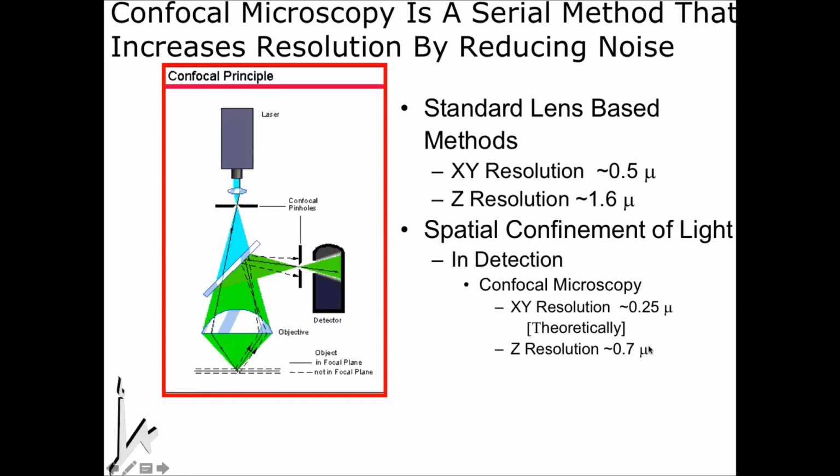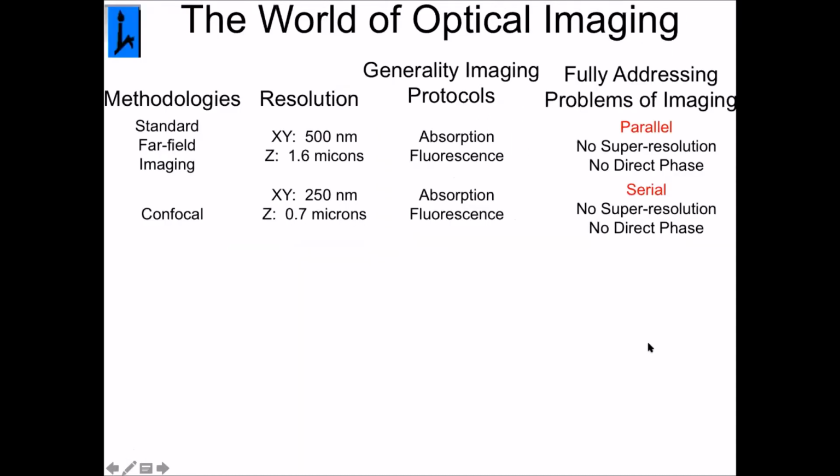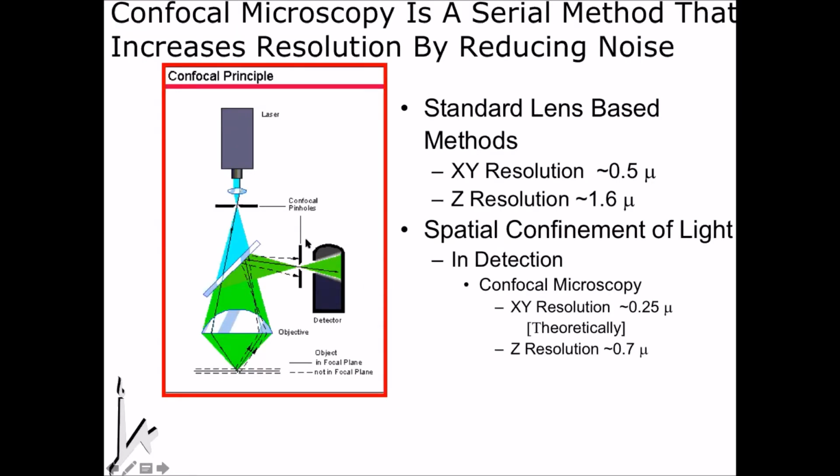So actually, confocal imaging can be done in 2 ways. One is you can scan the beam, and there's not much. I don't think nanomotion would be in that area. But you can also scan the sample.